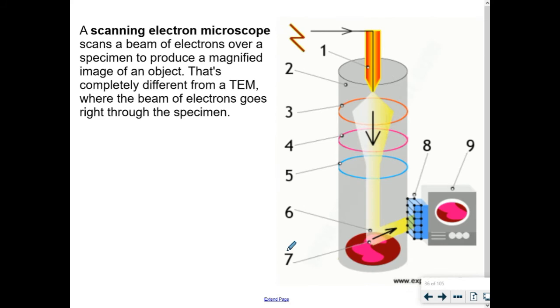A scanning electron microscope is kind of the opposite. When that person is feeling around, trying to see whether there's something in front of them for them to hit with their little walking stick, if they bump into something, that's the scanning electron microscope. Here the electrons do a very similar process. You focus beams of electrons very narrowly at a sample, but you bounce them. You don't want them to go through. You bounce the electrons off of the sample towards this detector. And as they bounce towards this detector, it gives you a picture of how these things ricocheted.